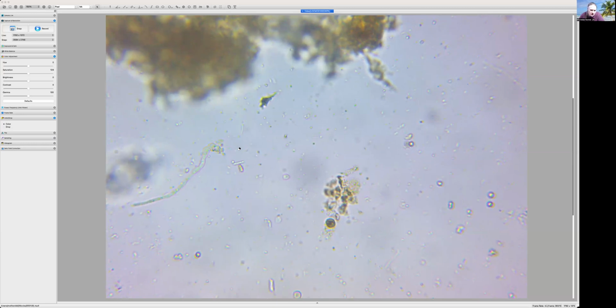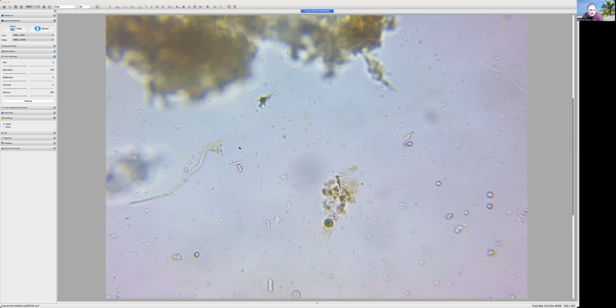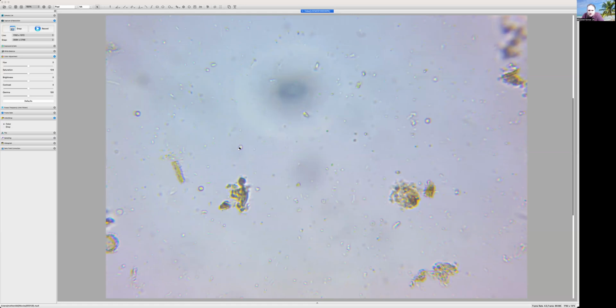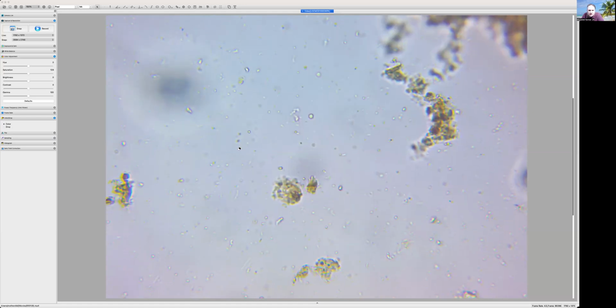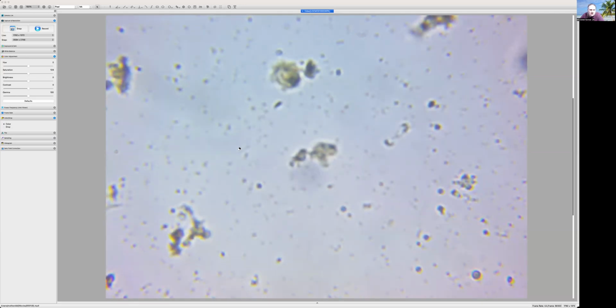So this looks like an oomycete like fungi here. The bubbles in it. Okay, so this, I wanted to see if I could, that shadow, if I could just get a zoom on that shadow. Oh, darn it.